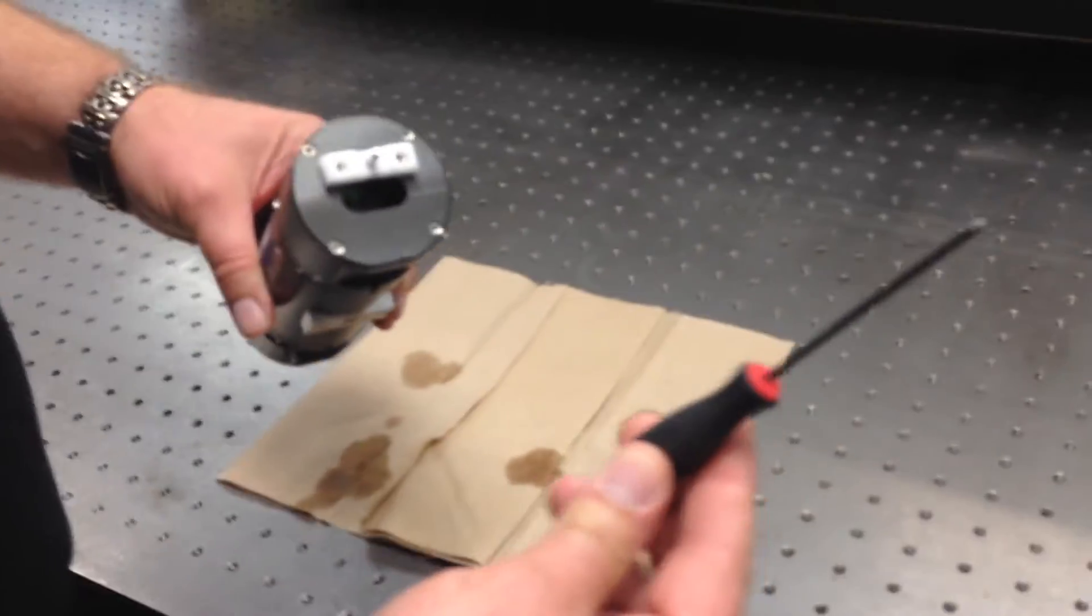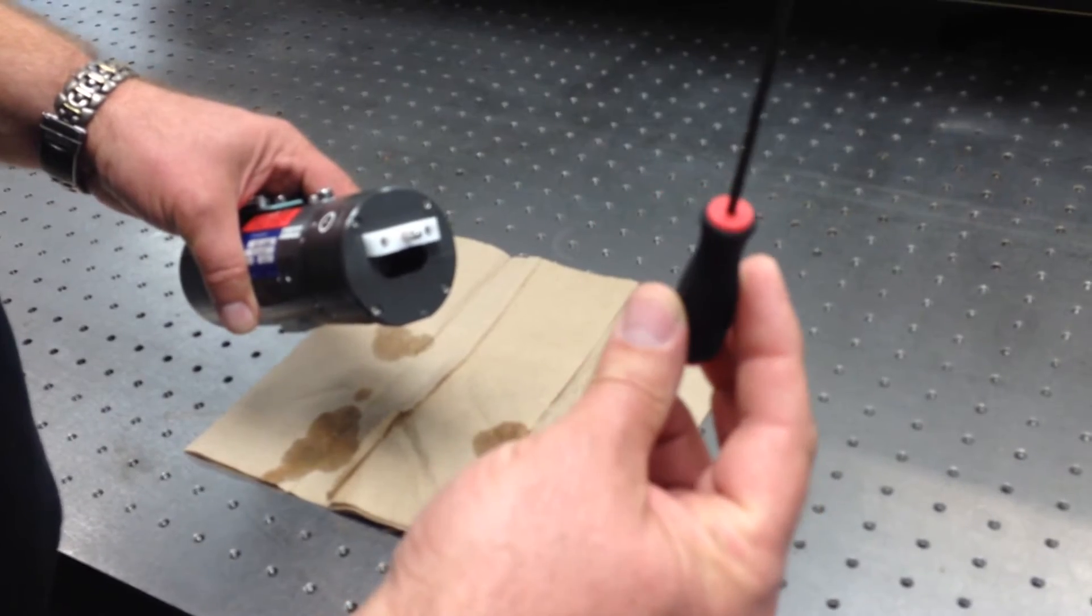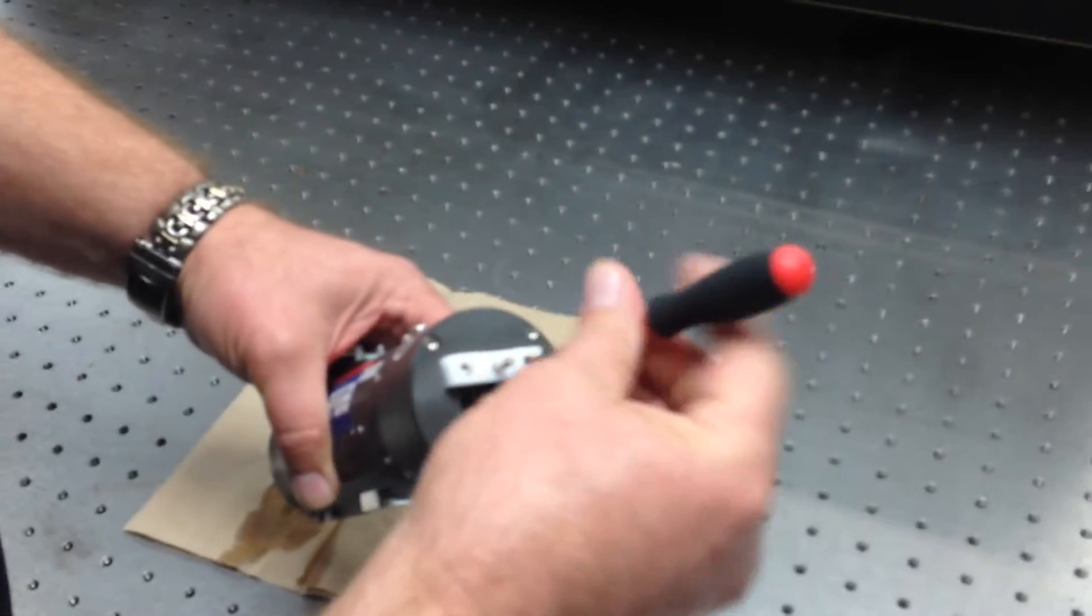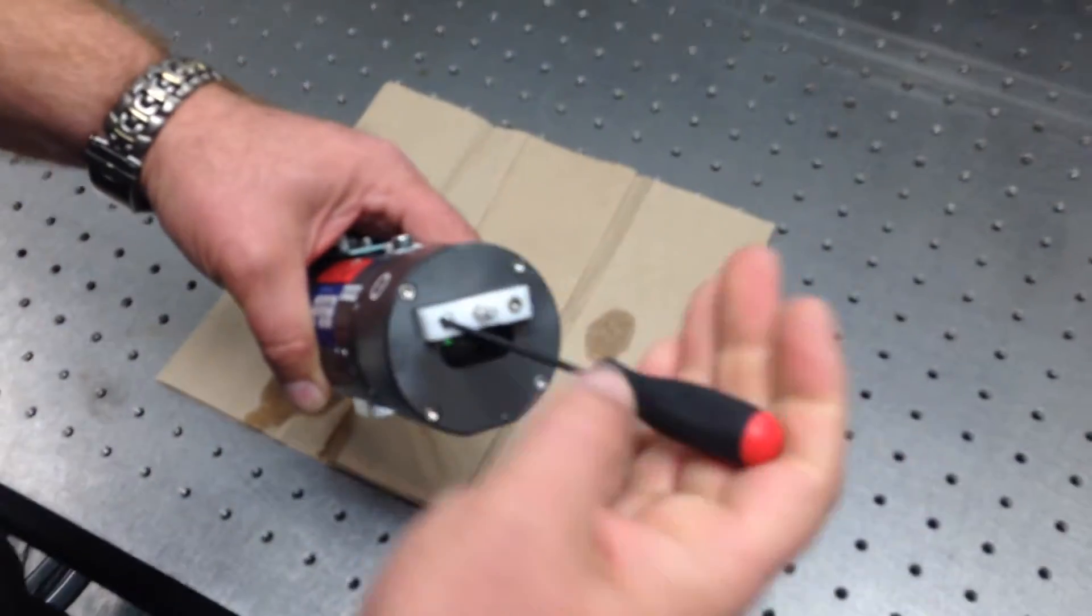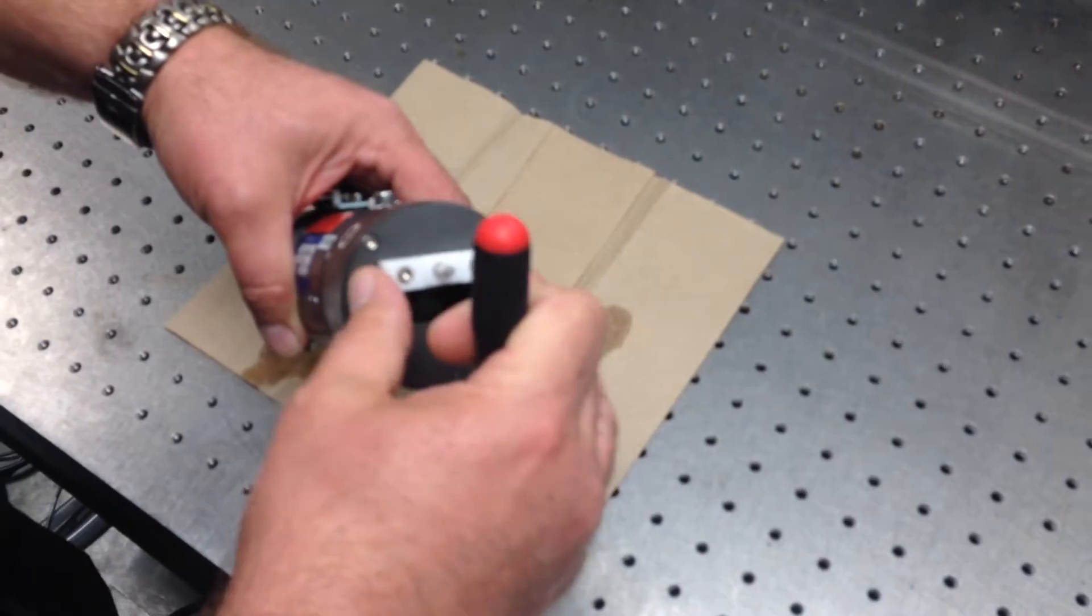So what we have here is a 2.5mm metric Allen and what we do is we want to loosen the clamps for the flash lamp on each side.